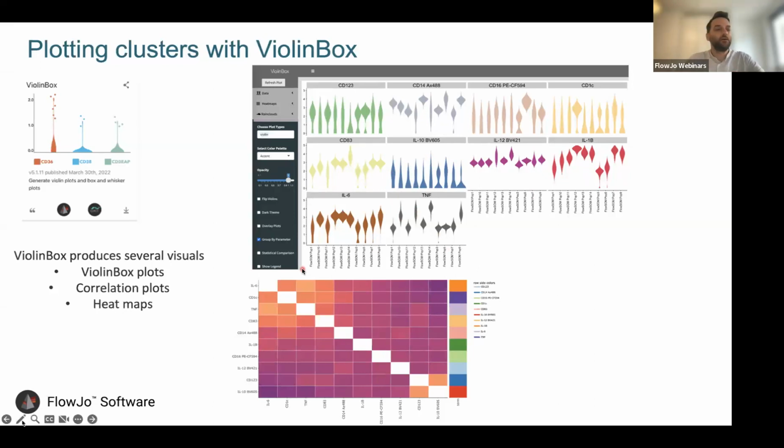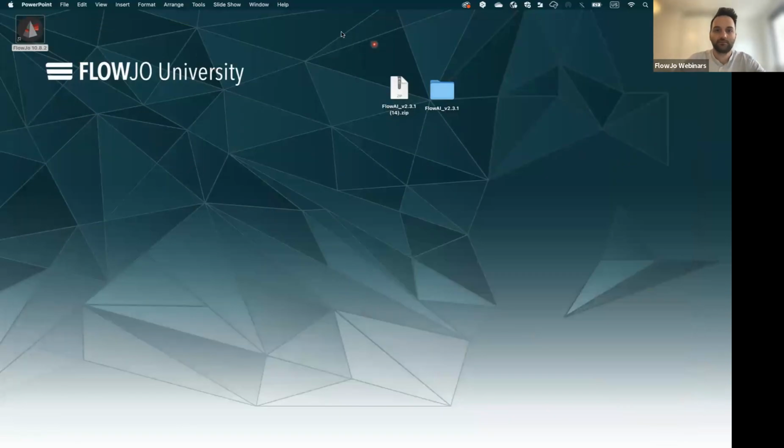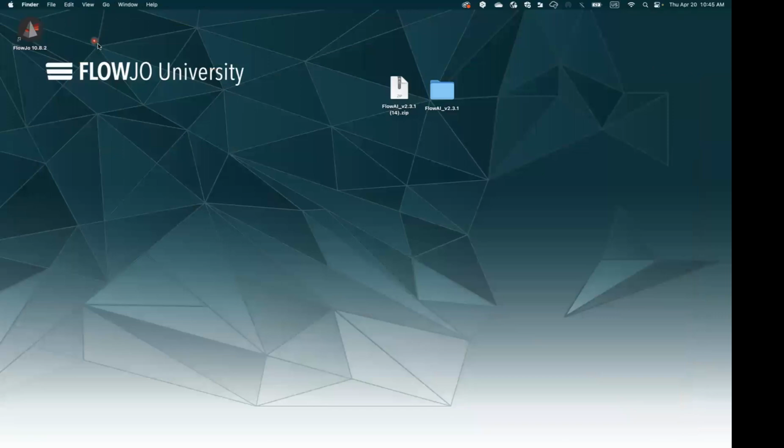Okay, so that's it with the presentation, and I will now skip to FlowJo and show you how we can do all those things. Okay, I'll check the Q&A box once again and the chat box. Okay, we're good. Again, if you have any questions, please let me know.